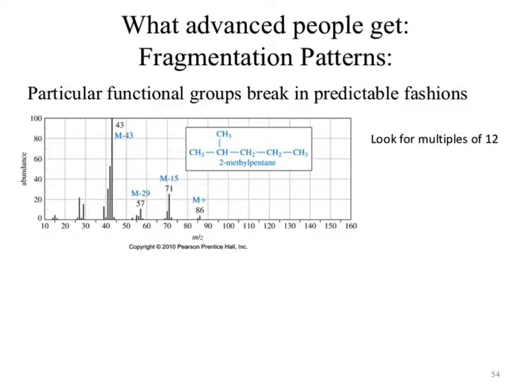86. All I'm given is this spectra, but I'm going to add some extra information in there. When I look at the IR, I see no evidence of an oxygen.